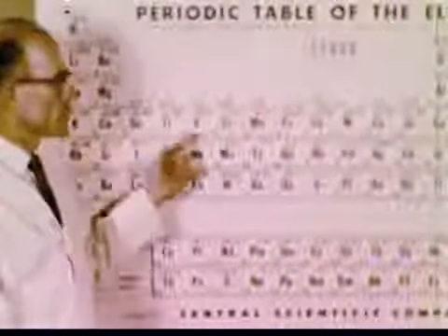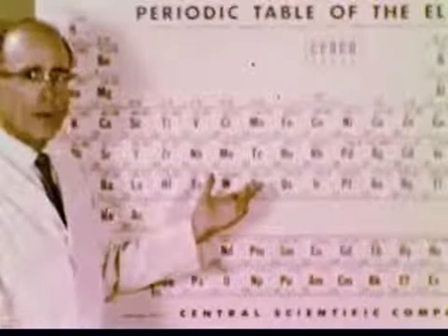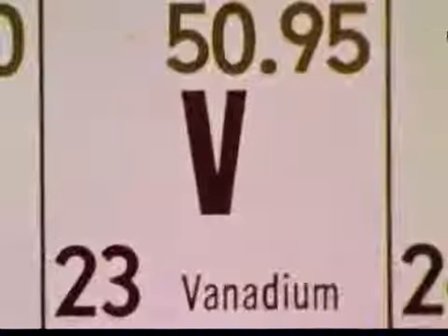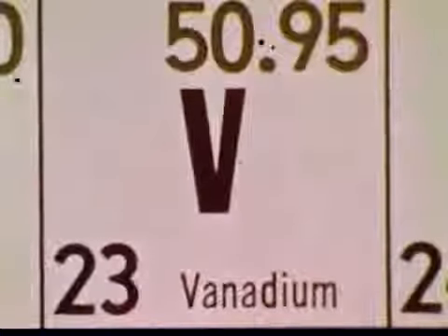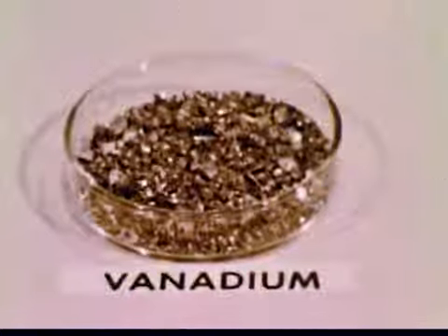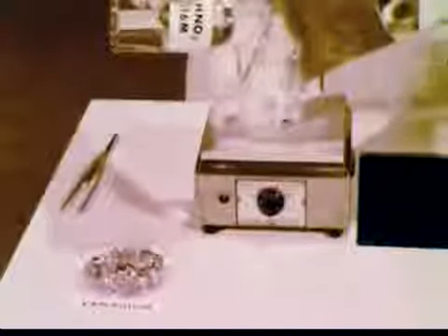The transition elements share many properties in common, so that what we say of one would certainly be descriptive of the others. We shall focus our attention on but one of these transition elements, vanadium. Here is a sample of metallic vanadium. Notice its luster. Let us first investigate the oxidation states of vanadium.